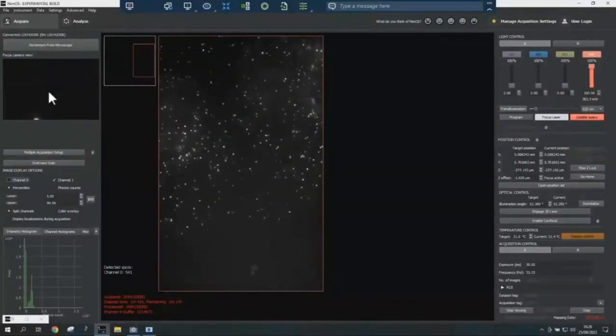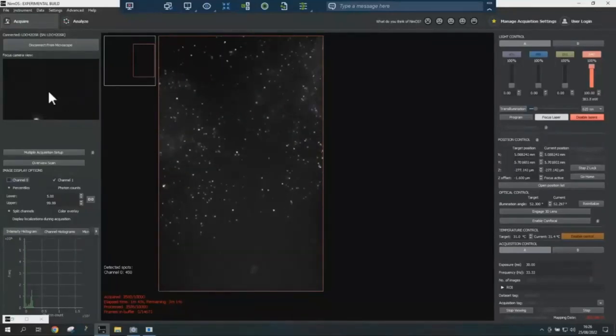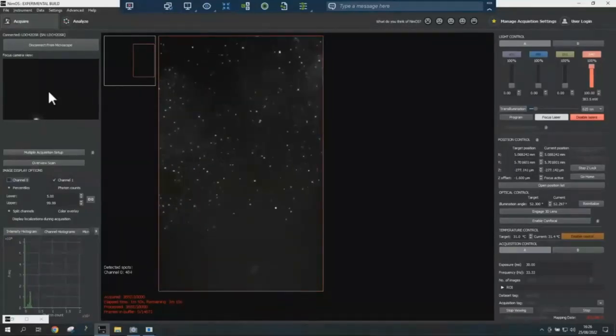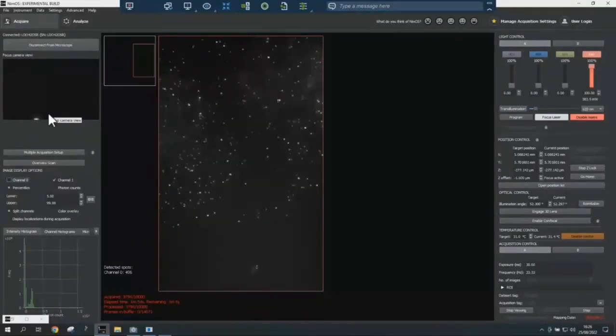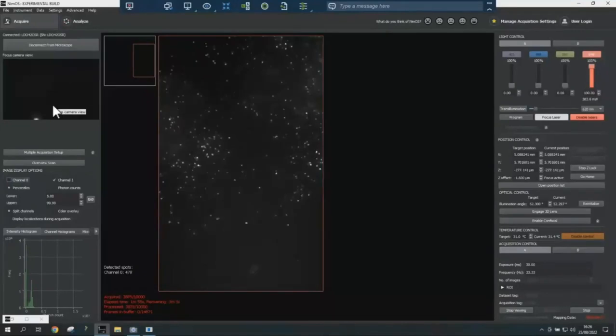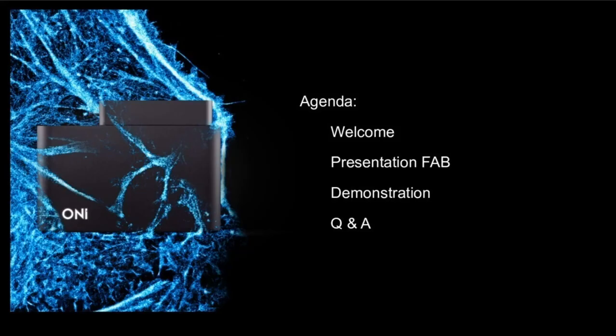And this is an infrared laser that focuses at the cover slip next to the sample. So by focusing this spot, it tells us where the sample is. Therefore, we do not need any eyepiece, or to look at our sample by naked eye. We just focus this spot and it tells us where our sample is. And this is very convenient. Oops, we lost the window here. Let me just go back quickly.